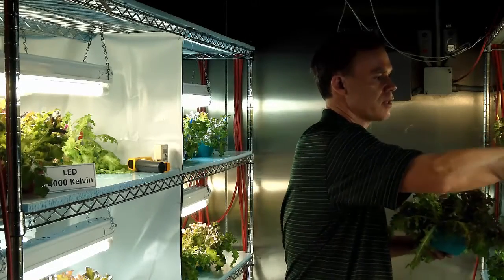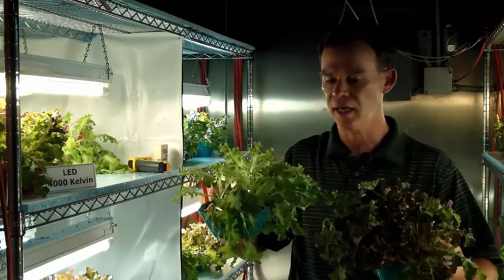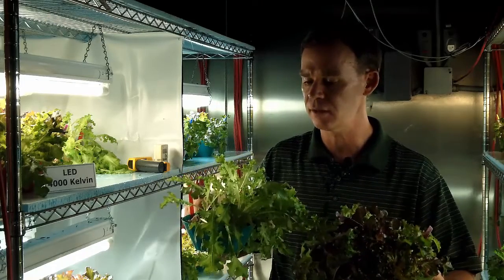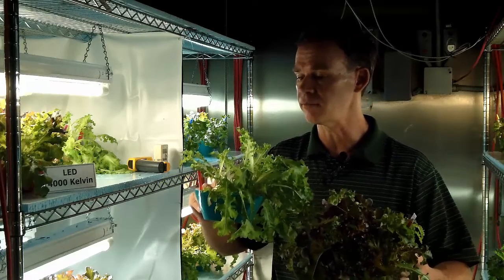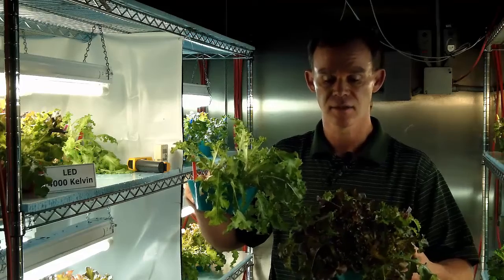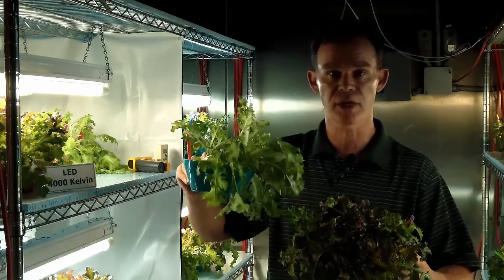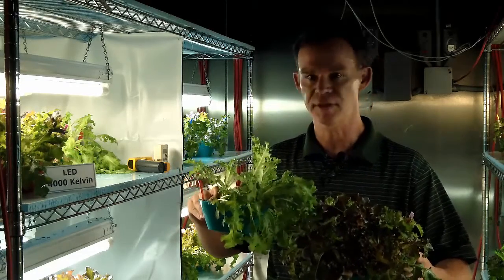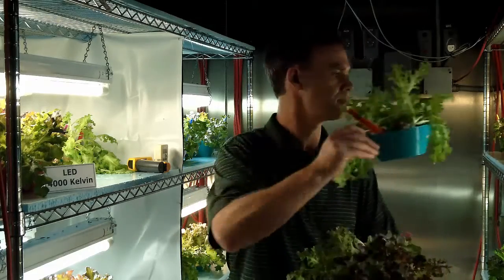But you can see these plants over here that aren't receiving as much light, and the difference in growth, where we've got a lot paler color, less of the red anthocyanin pigment, and if we measure the dry weight or biomass, which is a measure of total photosynthesis in these plants, we'll see that there's much lower dry weight in these plants receiving less light. You can also see they're kind of spindly and less leaf area and elongated.